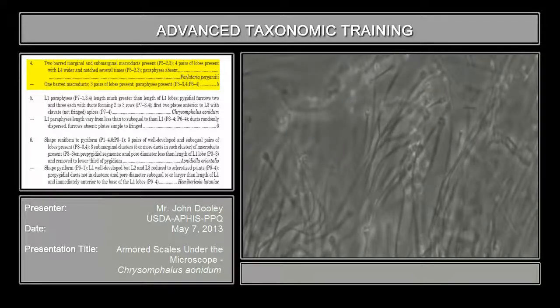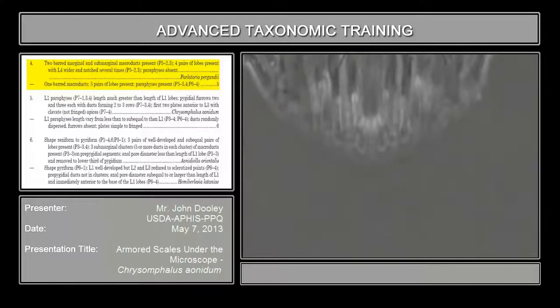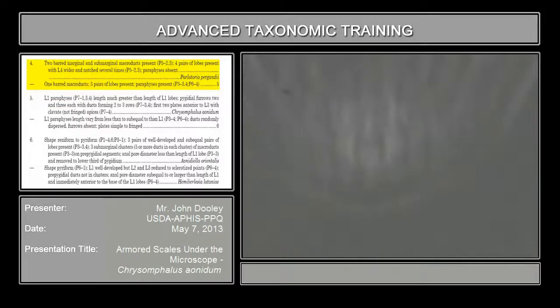There are some of these that are one bar. This is where you're going to get confused — this looks like two-barred, but it's really not. I don't have an answer as to why it does this at times, but this is all one-barred here.